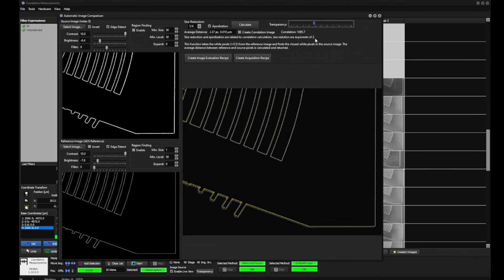Up here the images are very alike, but down here there are some differences. This can have two reasons. One is that the structures are, of course, not really written as they are defined. The other effect can be that the magnification of the microscope is a little mismatched, and we don't know what the reason is here.